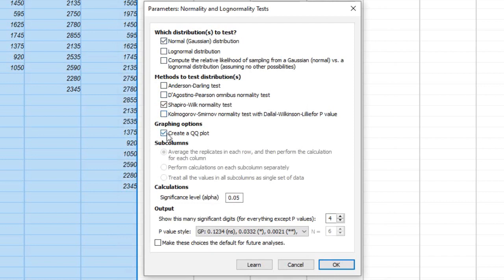Step 4. Set the Significance Level for your test. By default, it's usually set to 0.05, but you can adjust it based on your specific needs. This determines the threshold for determining whether the data is considered normally distributed.